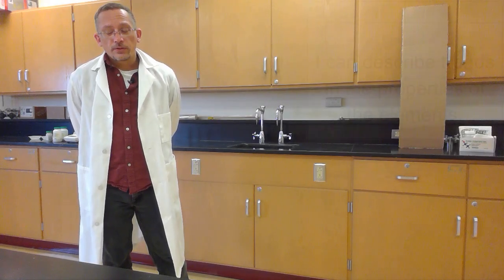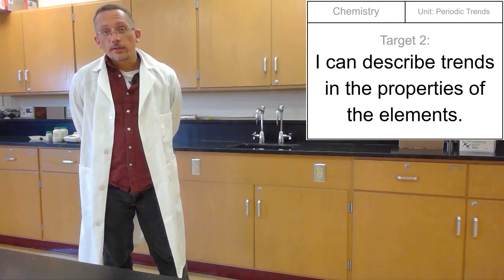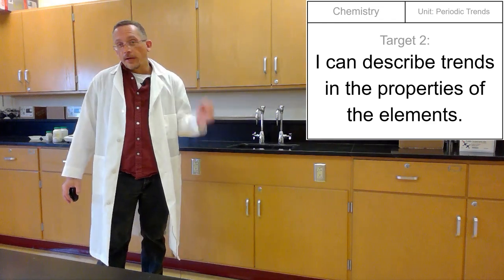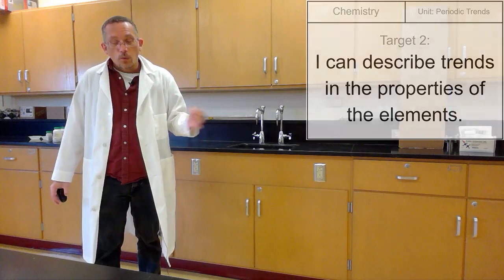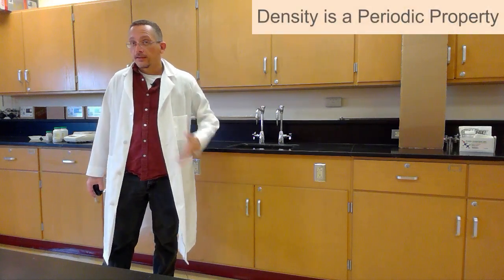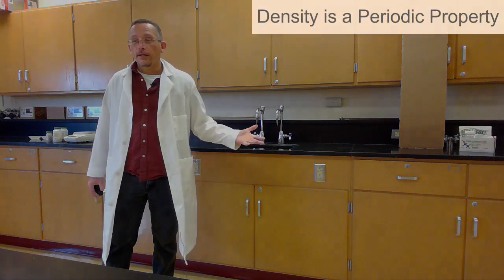Hey there, chemistry. So we are still working on being able to describe trends in the properties of the elements. And today we're going to do a little lab activity having to do with one of the properties of the elements in which you see a periodic trend. We've already talked about several different ones, but the one today that we're going to see is a trend in density. And so the lab we're going to do today is called Density is a Periodic Property.